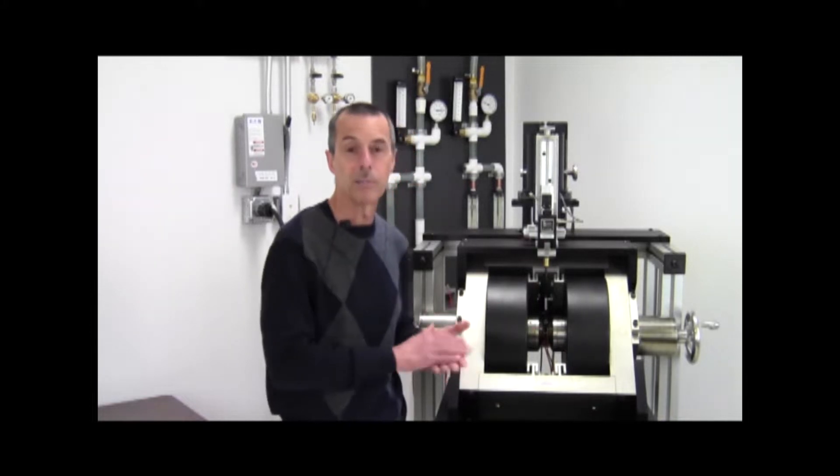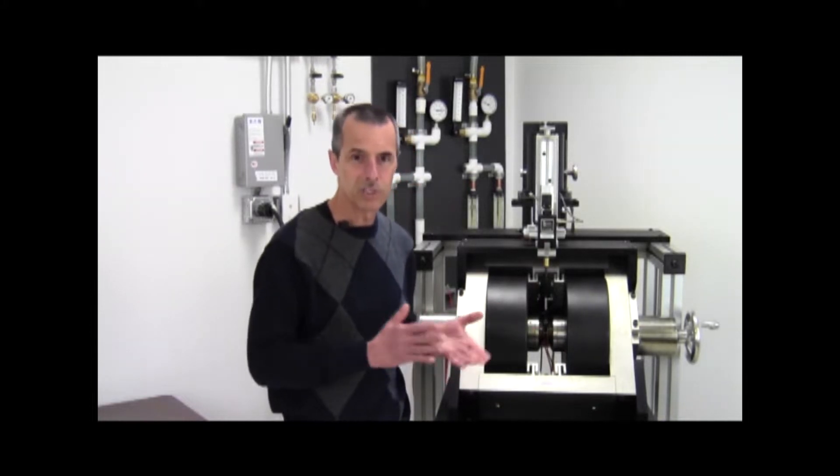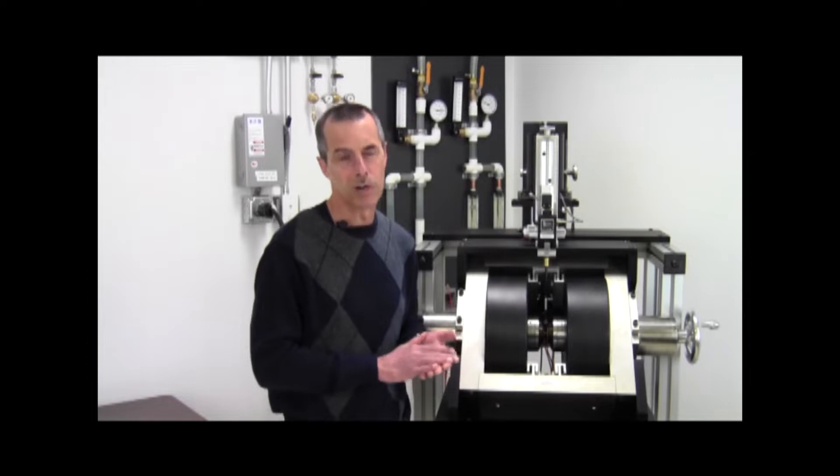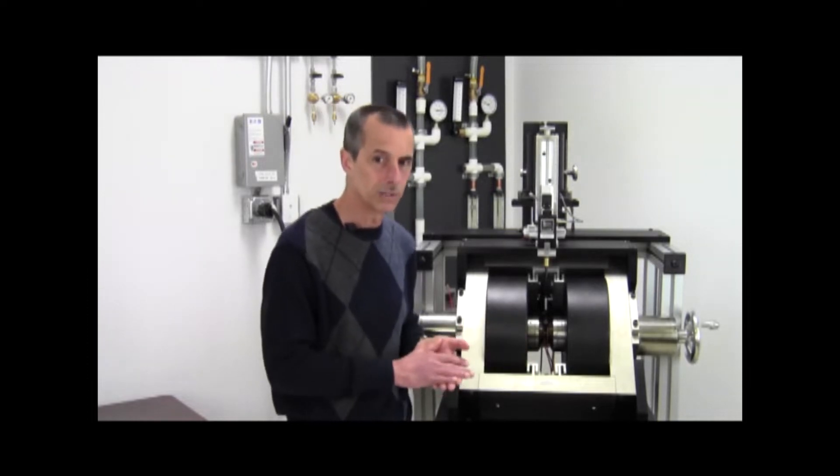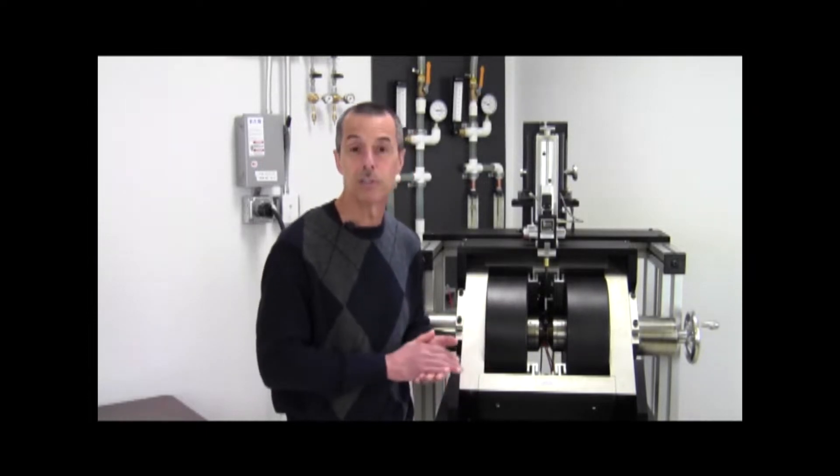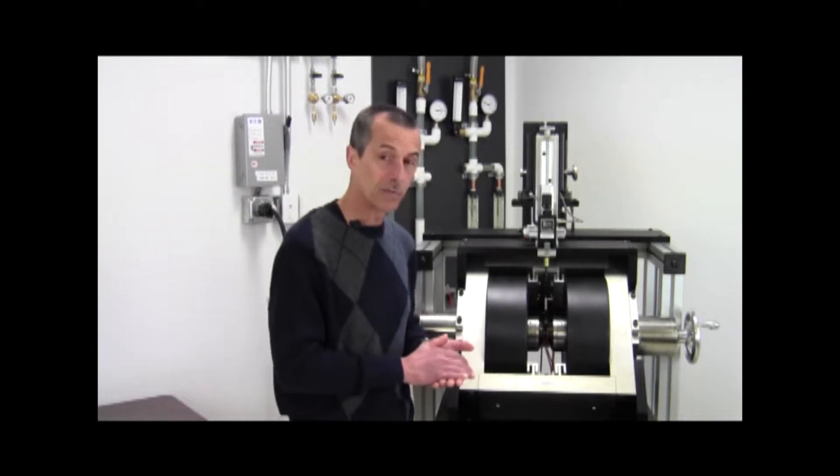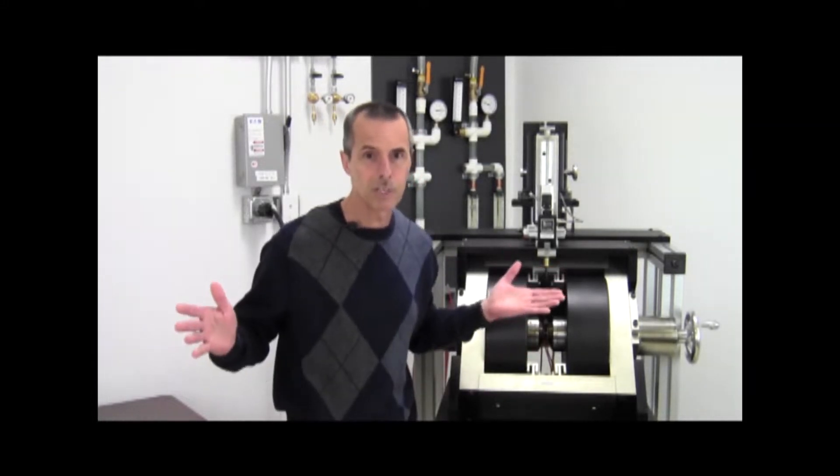And here again, these are very sensitive magnetometers. And of course, measurement speed is always desirable. In this day and age, we all want everything yesterday. And as you saw from this demonstration today, we could conduct a full hysteresis loop measurement in about 10 seconds, which is very fast. So, if you want to find out anything more about this system, please visit our website.